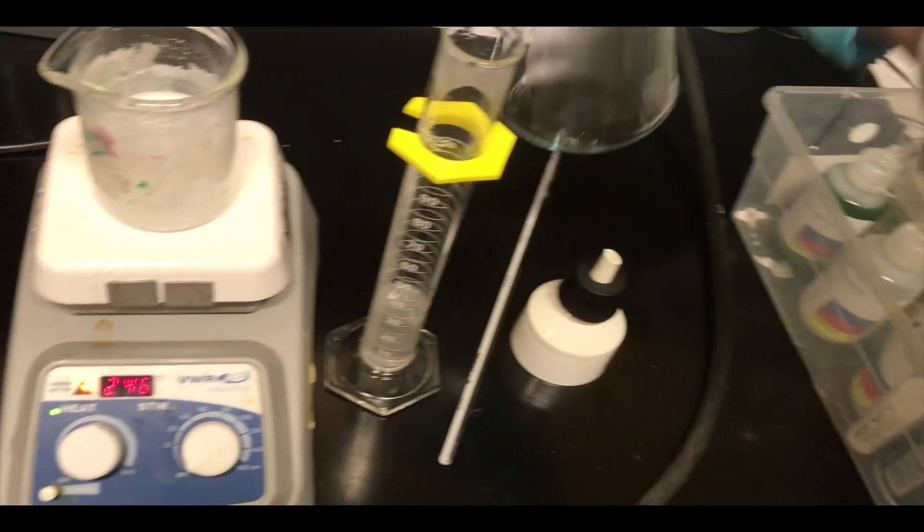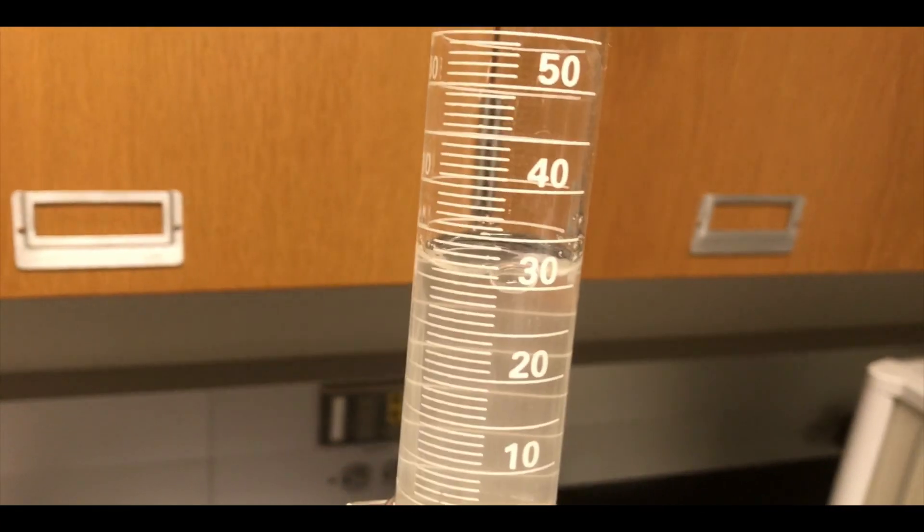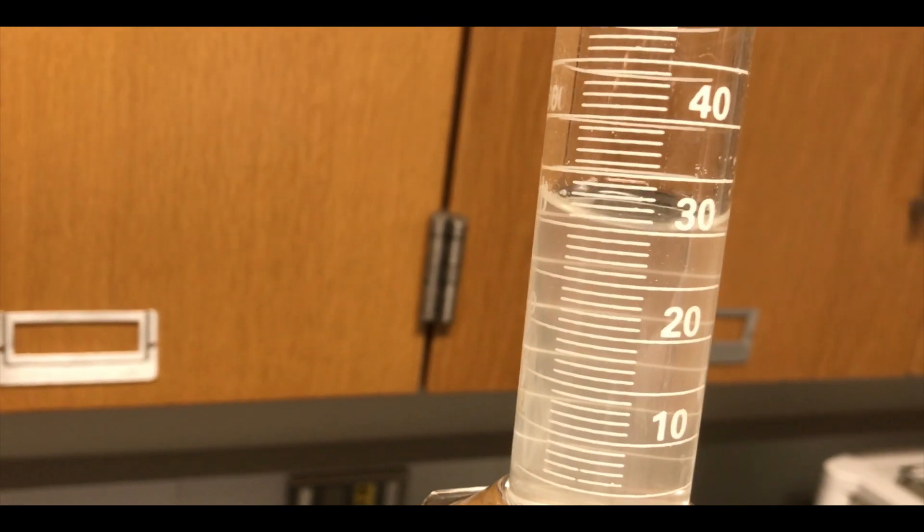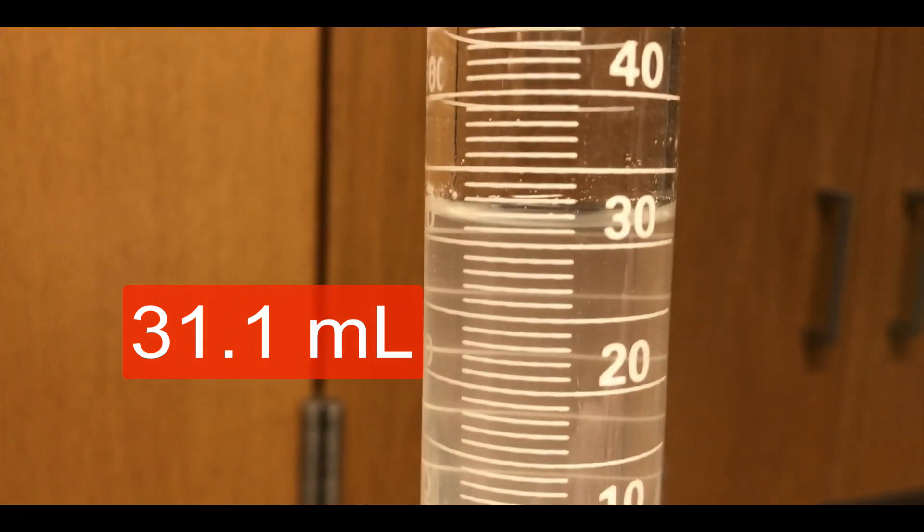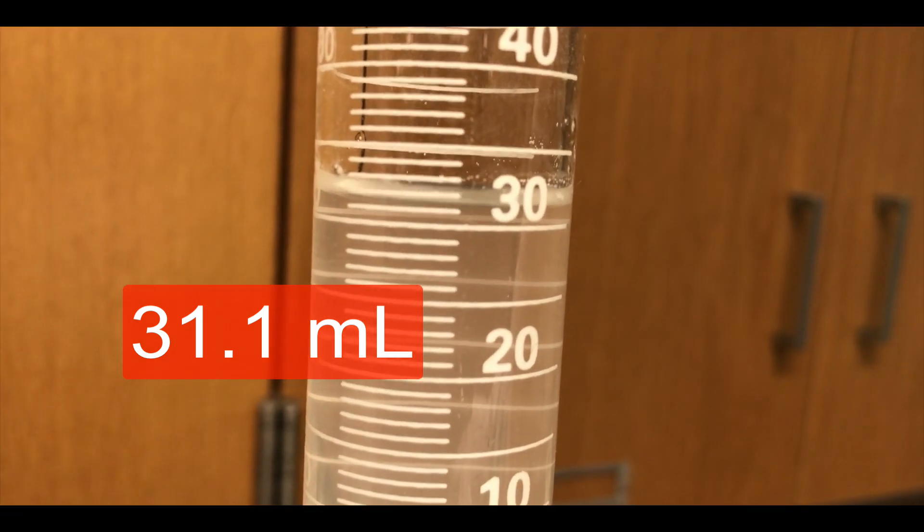The key thing is measuring, is reading how much volume is in there before we transfer into the Erlenmeyer flask and actually pursue the titration. So we'll look at the meniscus here to get a feel for exactly how much volume of magnesium hydroxide solution is in there.